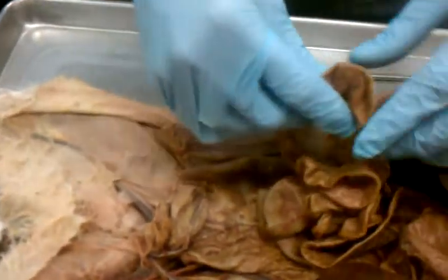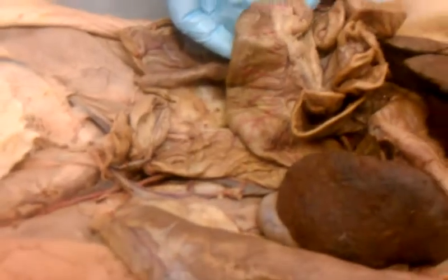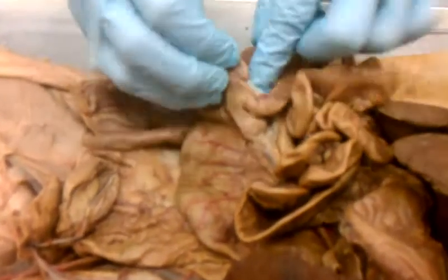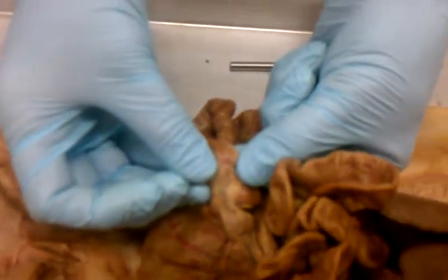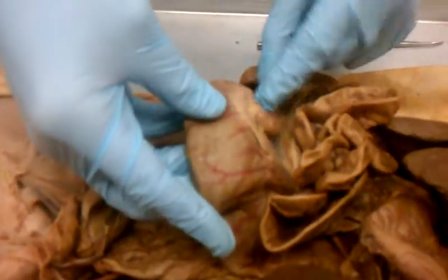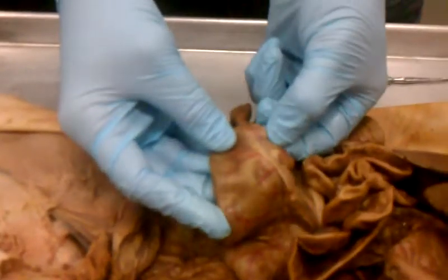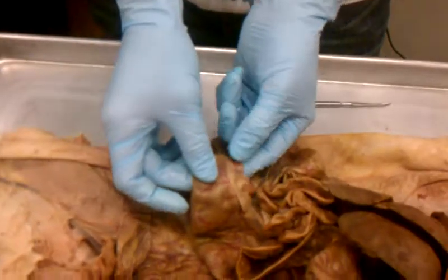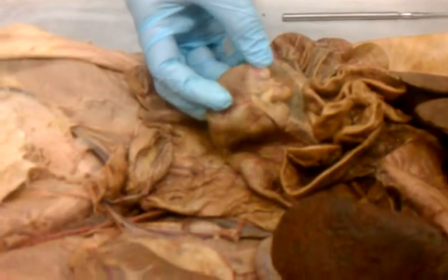So once you follow the small intestine, it runs into the large intestine. Where it runs into the large intestine, you have this little bump here, this little ball. That ball is the cecum. Ball on large intestine. So you have small intestine and large intestine. There you go. That right there is your cecum. It connects the small to the large? No, it's just right at that connection. The cecum is part of the large intestine.